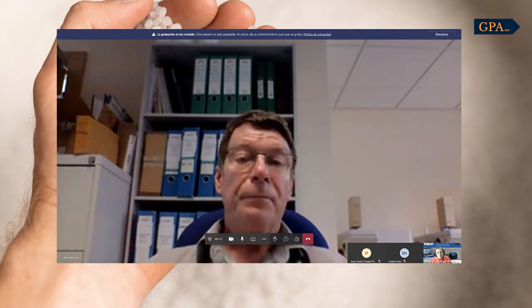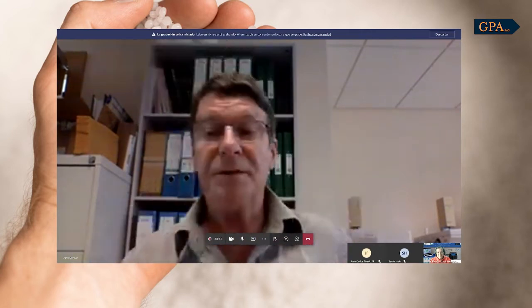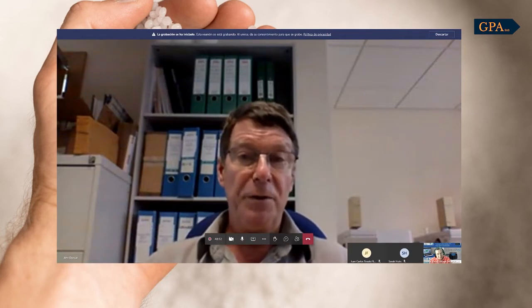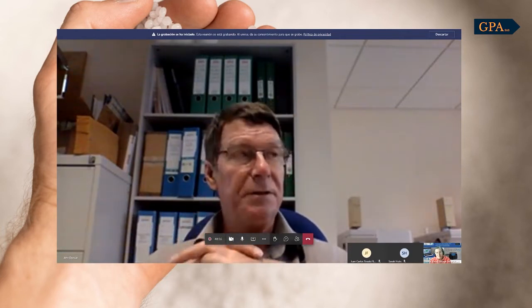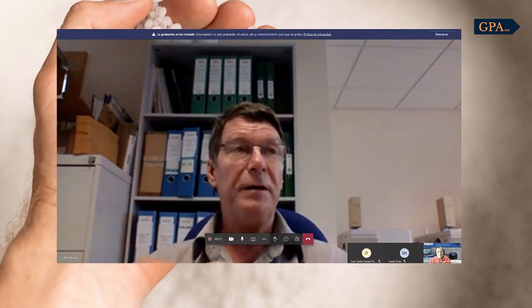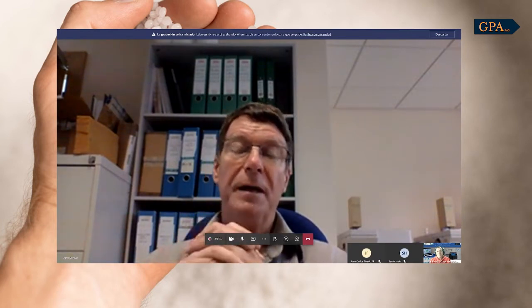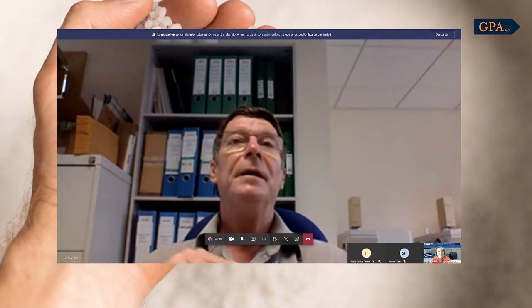Okay. The automatically determined melting points are typically within a degree of what you'd expect to measure on a DSC. The standard test you do on a DSC at 10 degrees a minute gives a melting point. We would expect to come within a degree of that, and that should repeat within that sort of accuracy. The end point is our own parameter.